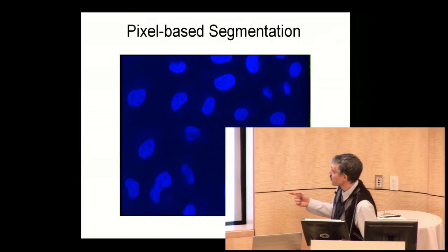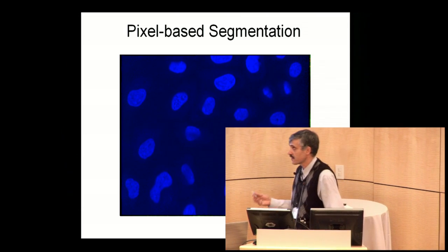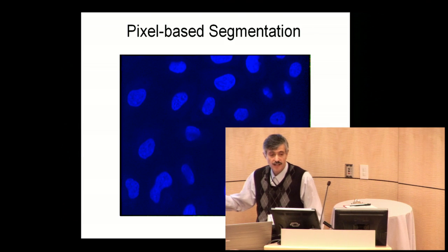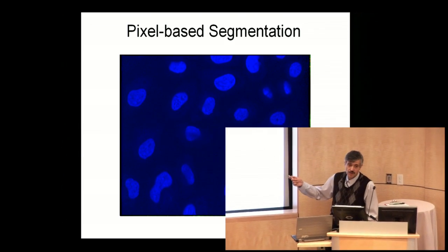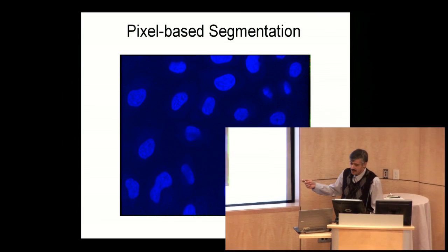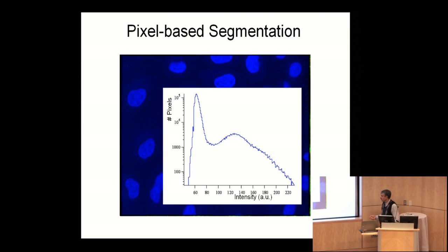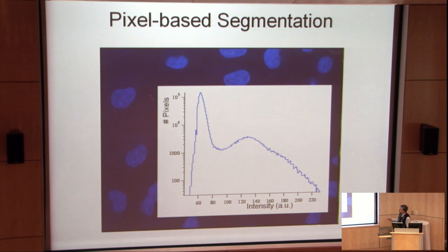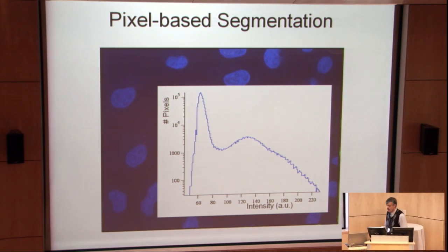So if you want to look at the nuclei, which are relatively big, what can you use here? There is a very standard approach. You can take a threshold, cut off all intensity below some threshold, then take the things above the threshold and find the boundary. This will be a very straightforward approach, and this will be the nuclei. So how to do it? Very simple. You take the histogram of intensities. You see a very clear peak, on a logarithmic scale, with the majority in this clear peak. These are pixels which belong to the background. You decide that this minimum corresponds to the transition point, and I will put my threshold somewhere here.